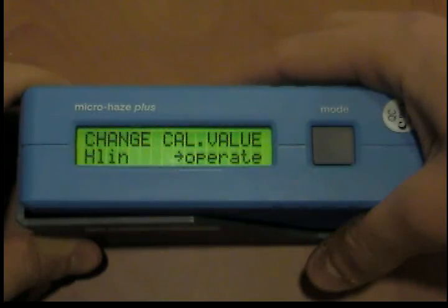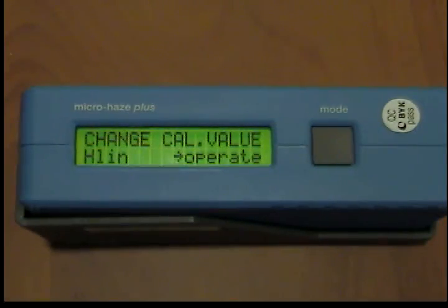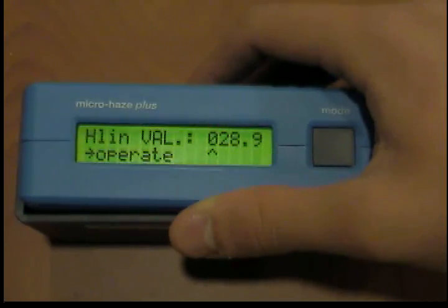In both cases, change cal values hlin is now displayed. The values for the new haze holder white ceramic standard are entered in the same way as the 20 degree value — first the haze value hlin is entered, and then the brightness value Y. As you can see, the mode change cal values for individual values can be skipped by pressing the mode button.